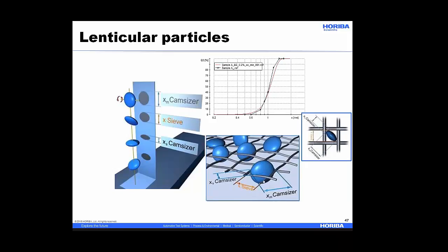Once we extract sizes from the CamSizer, generally XCmin, you might argue, hey, we can take the Feret max in order to find the long length of this. It still doesn't work so well because there's no single simple measure or obvious measure of the size of a lens-like particle that's going to fit through a mesh. You have to sit down with some geometry to start figuring out several different lengths and what fits.